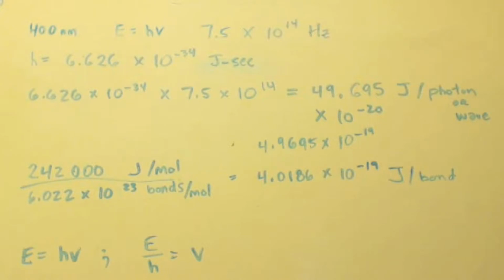I'm going to put a link to that site so you can see for yourself how they messed it up. You look at the chart where it says UV light 400 nanometers, and it has the wrong thing. But what's funny is the same chart has visible light of 400 nanometers, and it puts the correct hertz. Out of the millions of charts, I had to pick the one that had the typo.